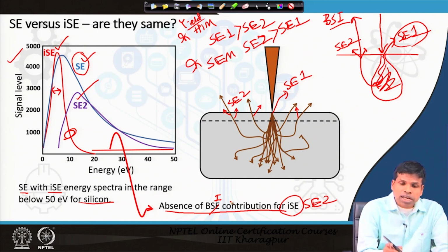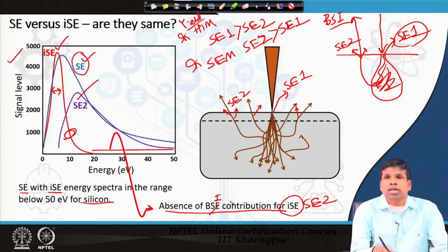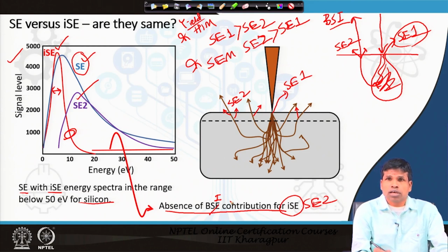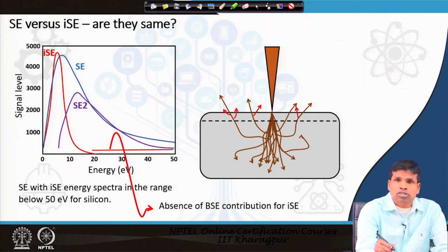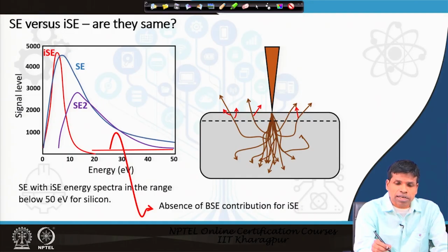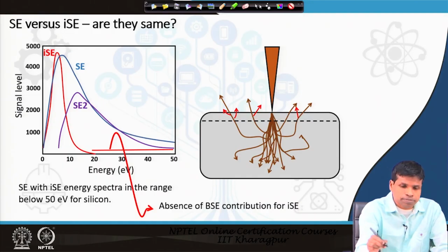So, this is the difference, and therefore helium ion microscope gives much superior resolution as compared to the scanning electron microscope. Initially, we have seen in case of helium ion microscope, the wavelength is much smaller, therefore we can get much smaller spot size. In addition to that, much less diffraction, and those are two other important reasons why helium ion microscope gives the superior surface resolution. And in addition, we have seen how secondary electrons are generated just near where the incident ion is interacting on the specimen.